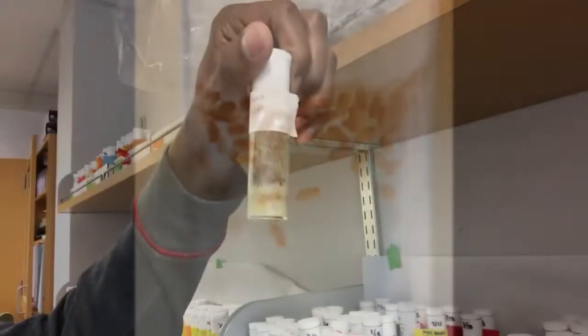I also use Drosophila fruit flies in my research, as you'll see. You might have also noticed the lab is really empty, and that's because of the COVID shutdown. But these flies have got to eat, and I have hope that we will get back to research soon, so I need to make sure they can continue to propagate so I can use them in my research.